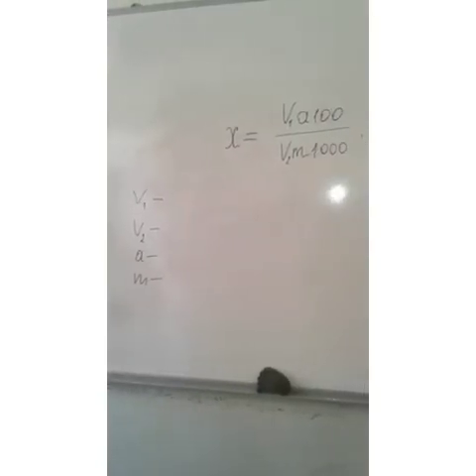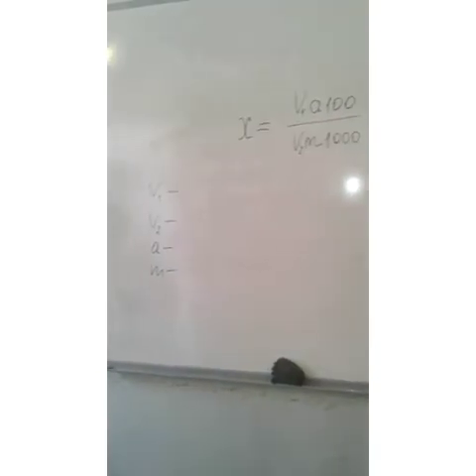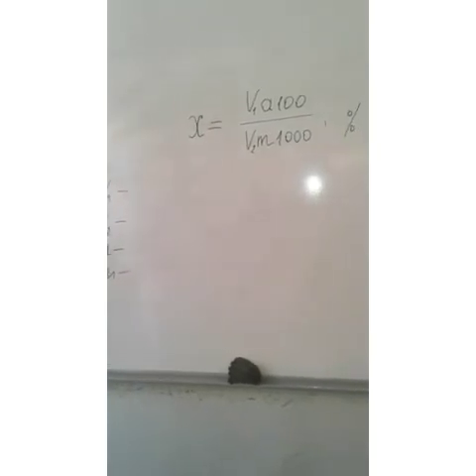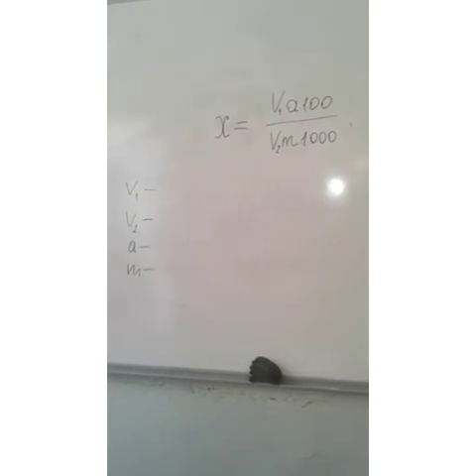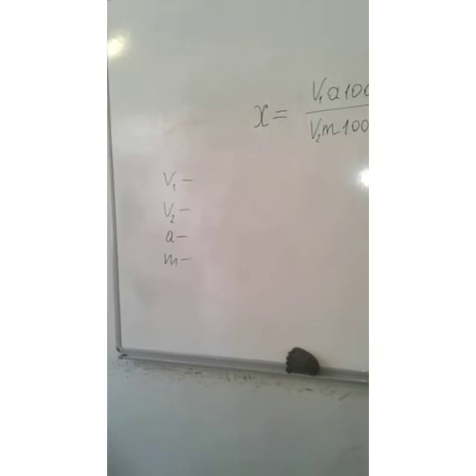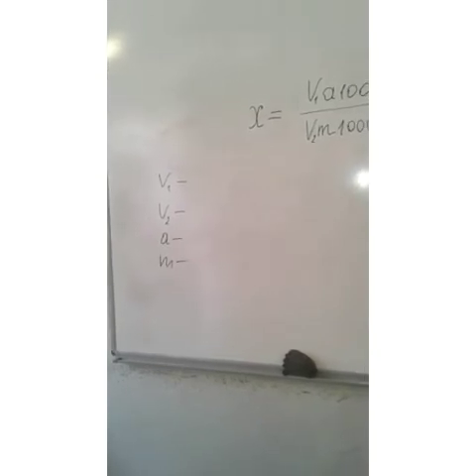We multiply the number of consumed milliliters of potassium permanganate by its titer, expressed in milligrams of copper. According to the tables, we find the corresponding amount of sugar. At the end, given the dilutions, we express this amount of sugar in percent. The calculation is carried out so.